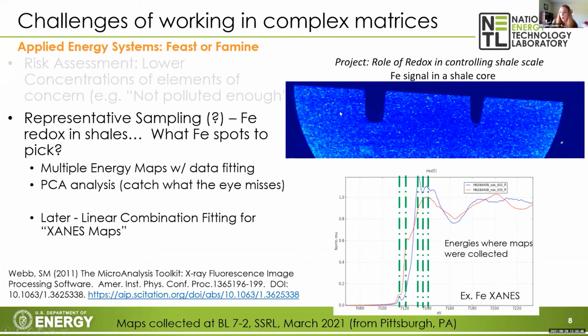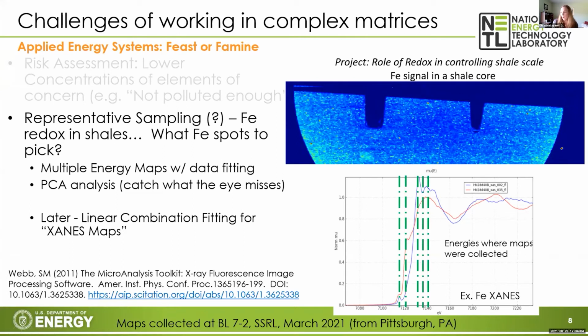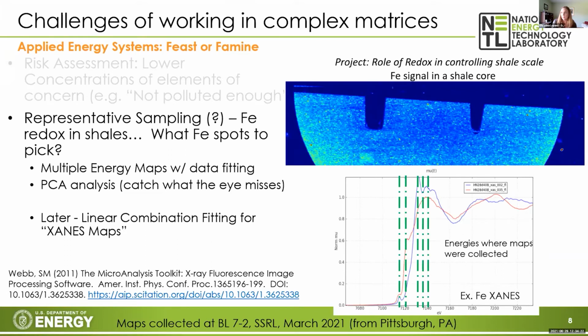So for example, if I click through, if you watch this map area, we collected XRF maps at these energies in the green lines along the way. So if you watch the map, you can see some of the subtle differences. This is something that can be done when you have a very stable monochromator on the beam line, and this is a technique that we utilize all the time in our research. So go ahead and watch the map, and you can see the slight map differences. Oops, I think I lost some of my maps there, as we take maps along these slices.